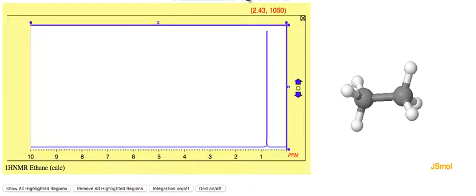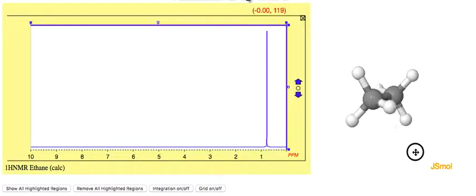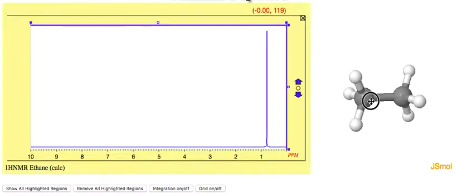Okay. So here's ethane, and we have 6 hydrogens now, and they are all equivalent to one another, and so we get another singlet peak here, and you notice it's been pulled downfield a little bit, and that is because this carbon here has more pull than hydrogens, which means that this is affecting these hydrogens and what their environment is, and then this one is affecting these hydrogens and what their environment is. So it gets moved downfield, and of course it's just that one peak.